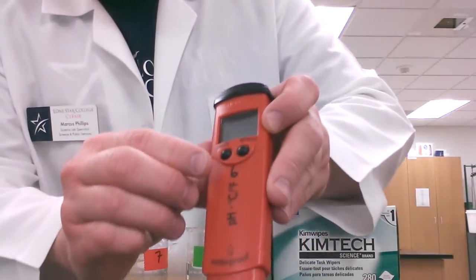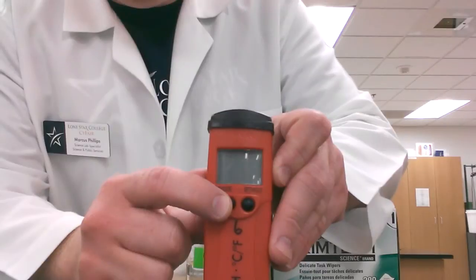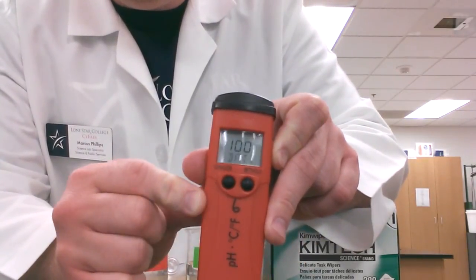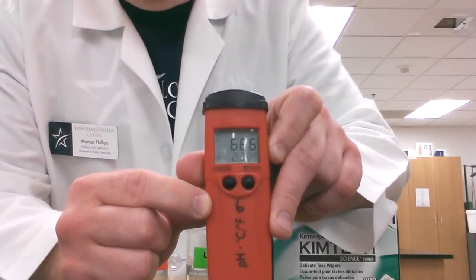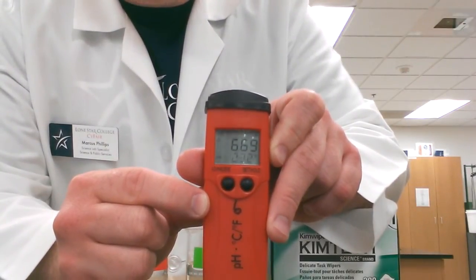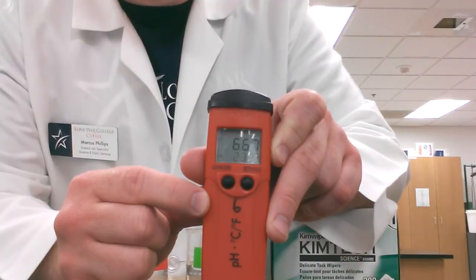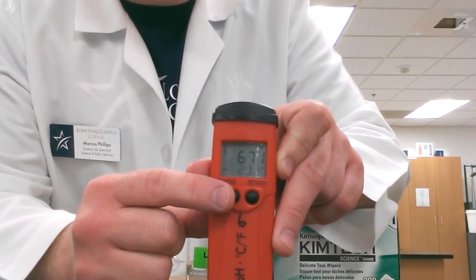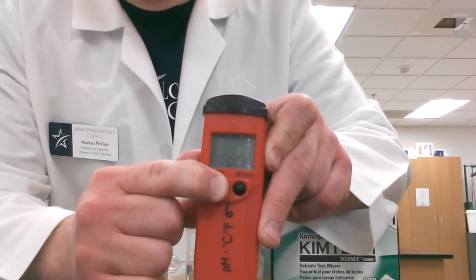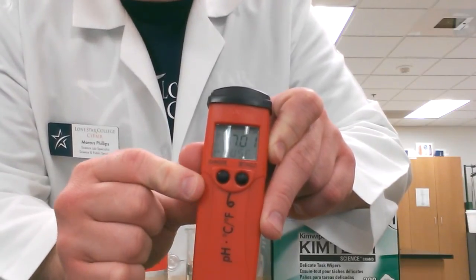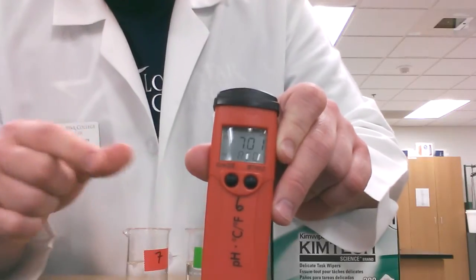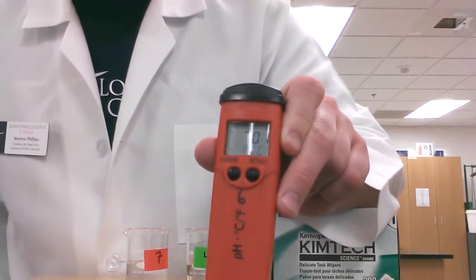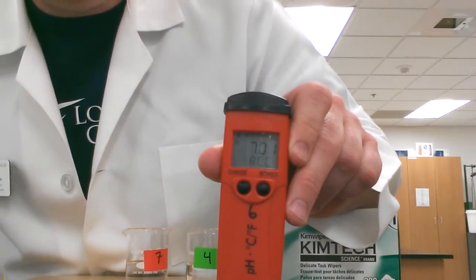We're going to turn on the pH meter by holding the on button for a full second. Now once that's on, to get to the calibration mode, you're going to push the on button one more time, but this time hold onto that button until you see the word CAL. Once you see that, you're going to see 7.01 and the word buff below it, or the word REC.